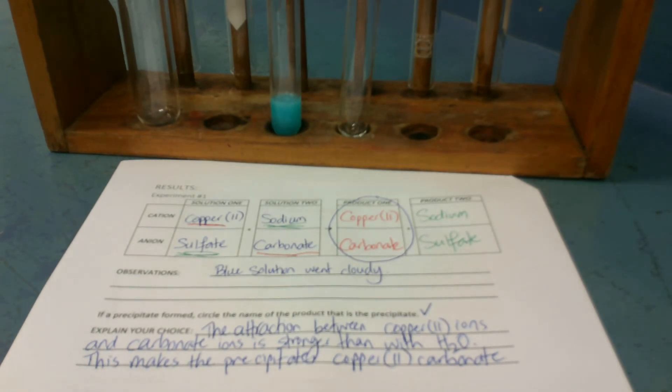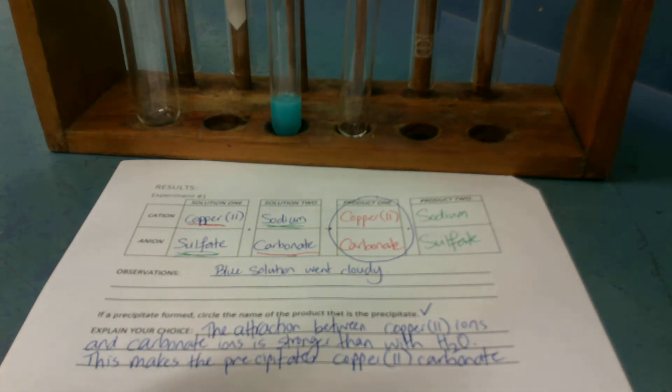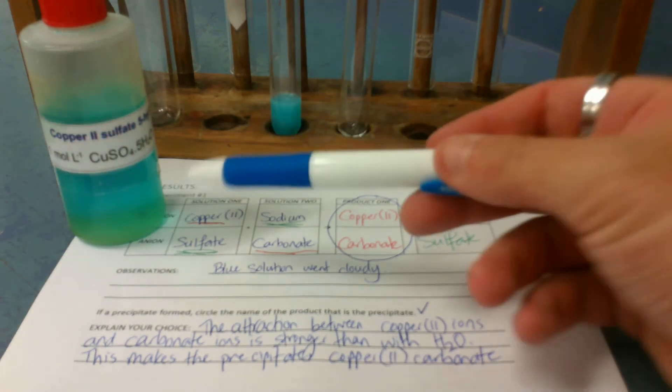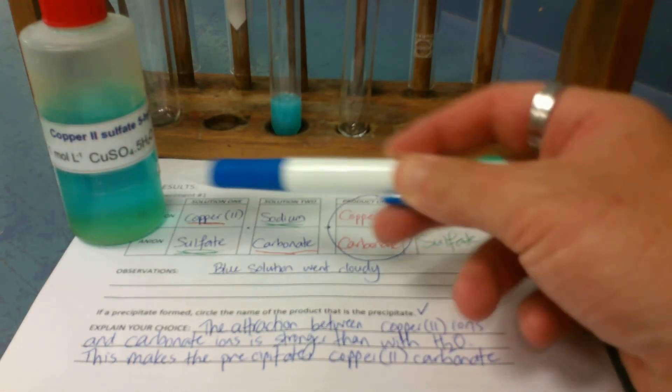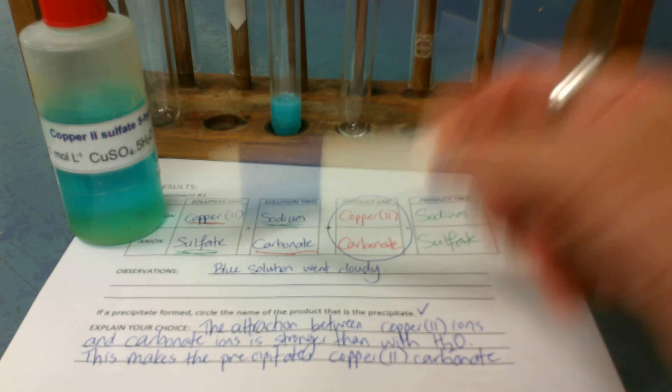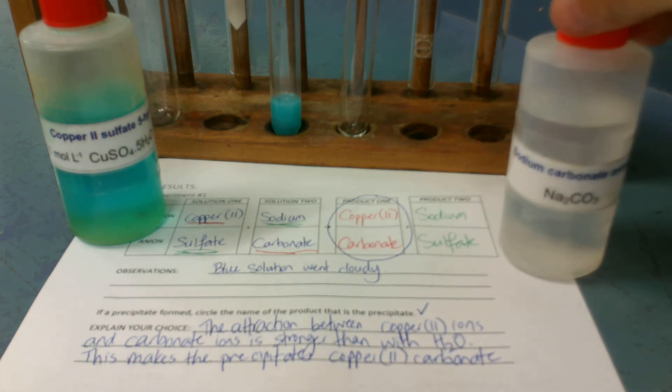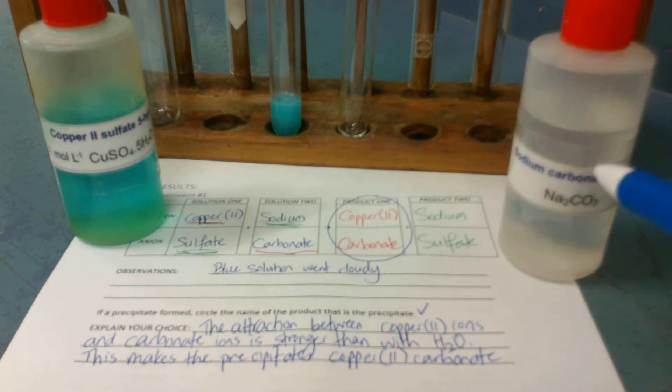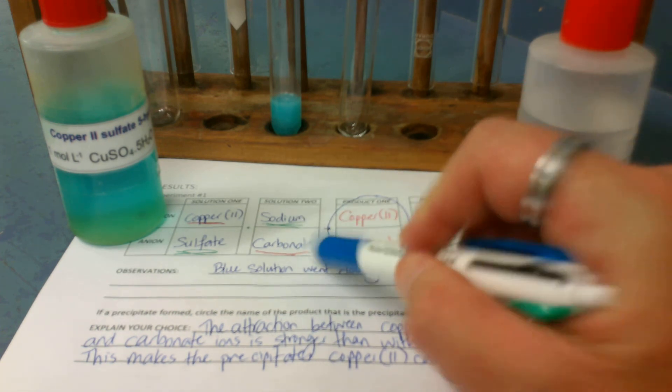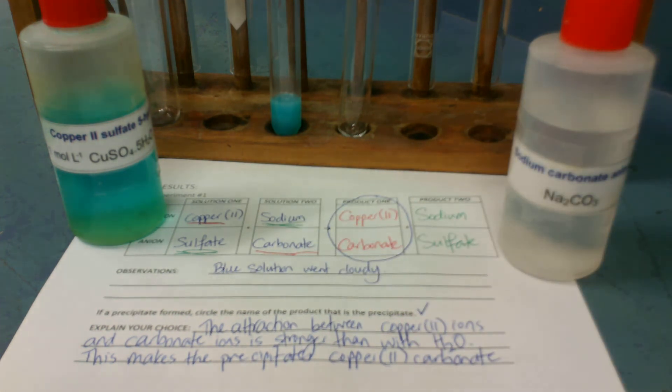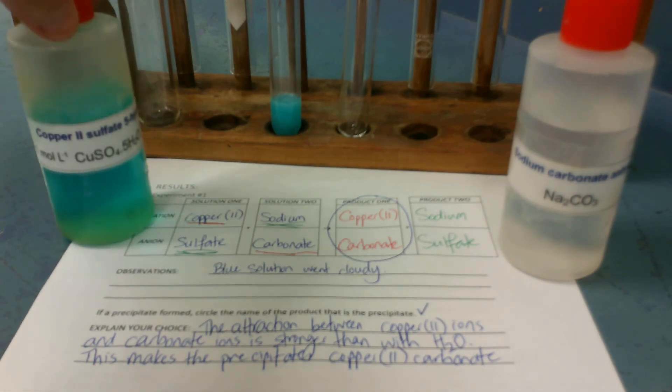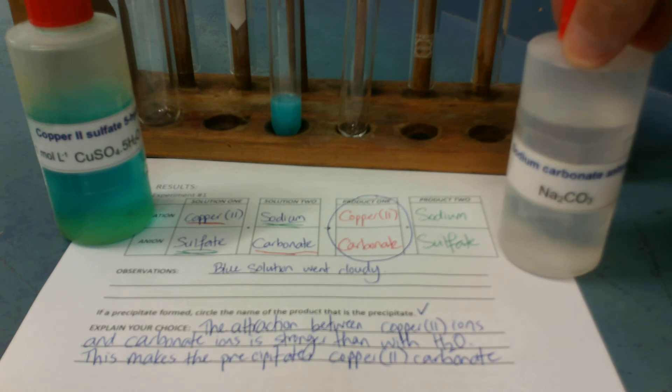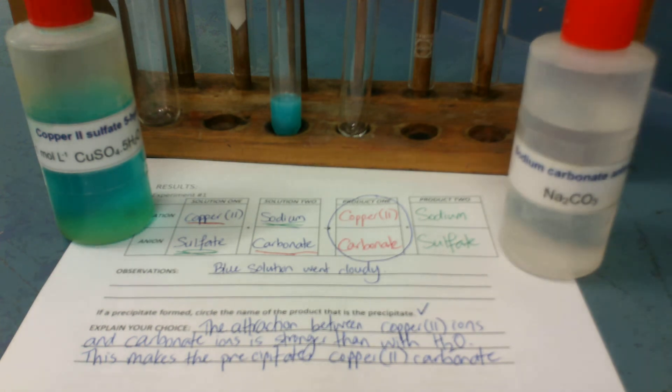All right, so just a quick recap. Get one solution, call it solution 1. Put its first name in the top box, its second name in the second box. Get another chemical, call that solution 2. The first name goes in the top box, the second name in the bottom box. Then, put about half a centimetre of solution 1 into a test tube, add a few drops of solution 2, and observe what happens.